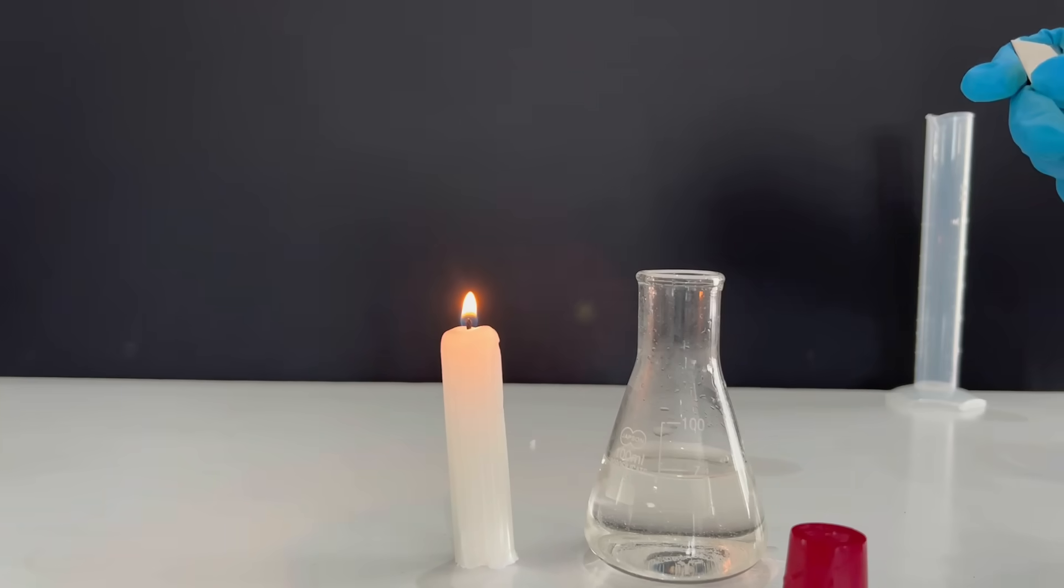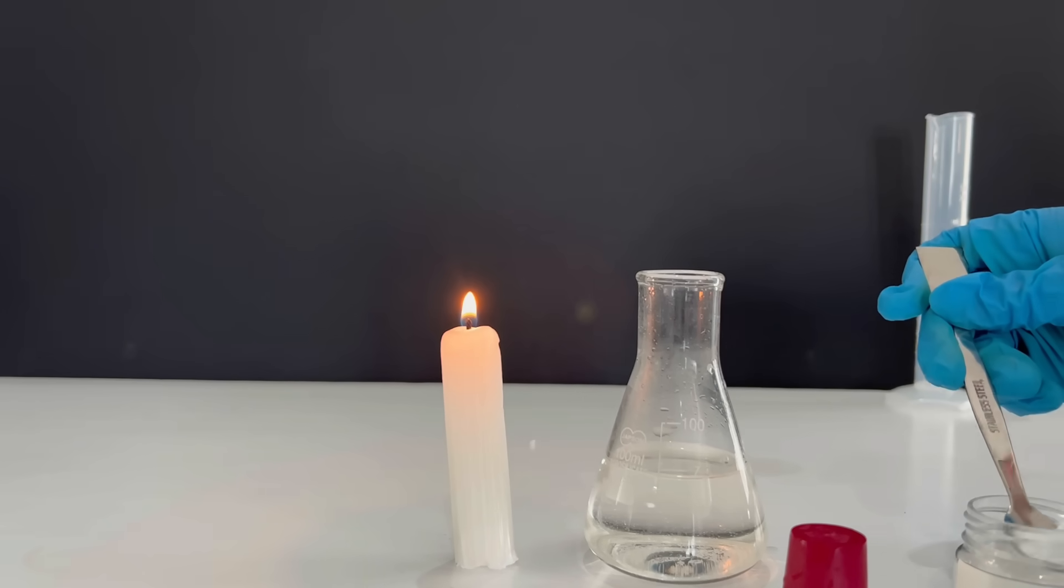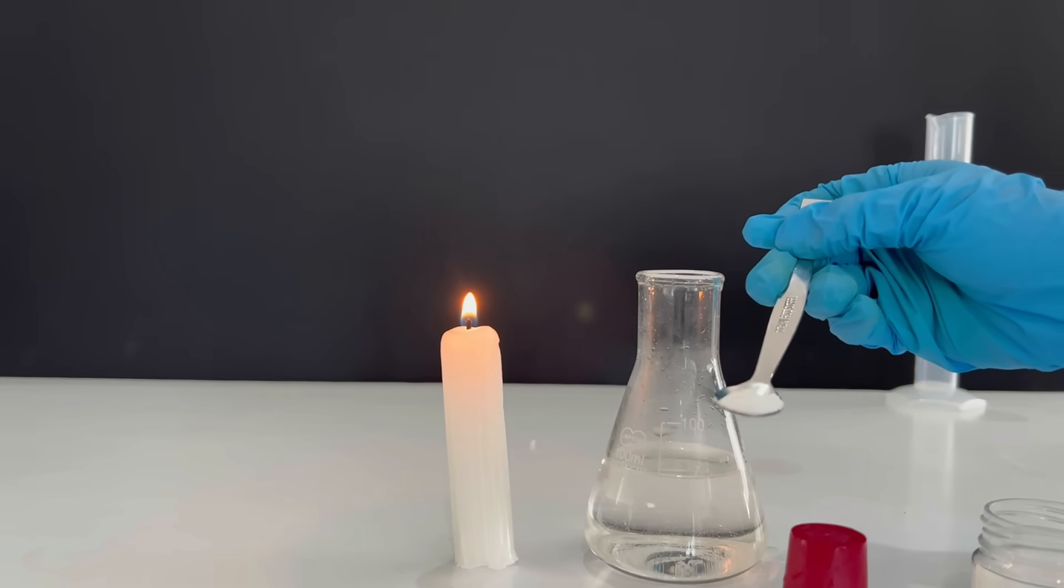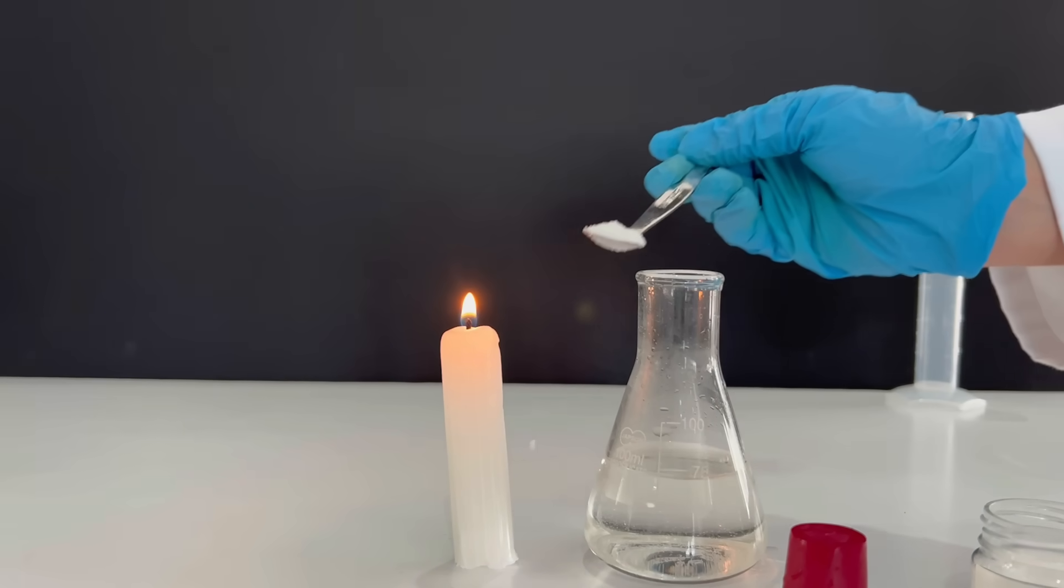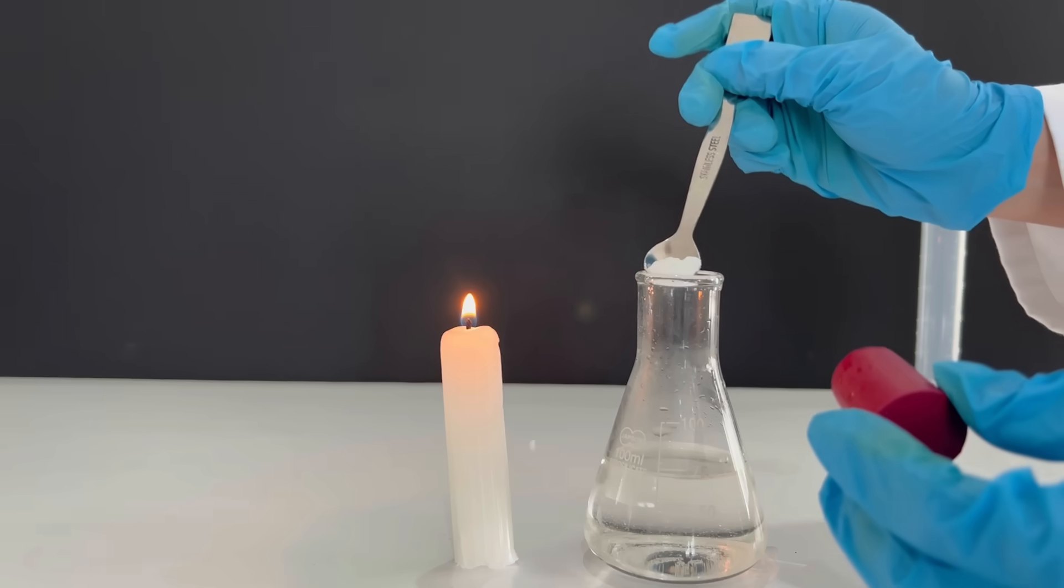Let's add our half a spatula of sodium bicarbonate into the Erlenmeyer flask that is filled with acetic acid and water. Remember to have your stopper ready. We'll add this and then we'll close it directly after that.